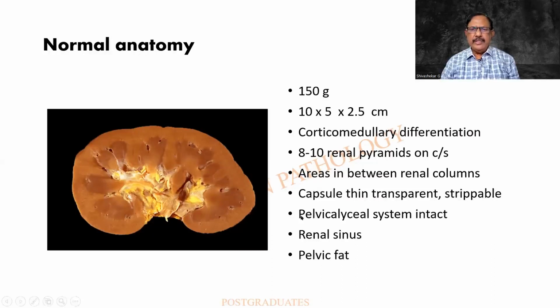The dimensions, though not perfect, this is a good logic. 10, half of it is 5, half of it is 2.5 centimeters. 10 into 5 into 2.5 centimeters will be the length, breadth, and the thickness.